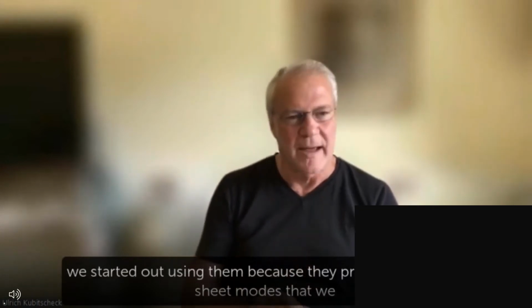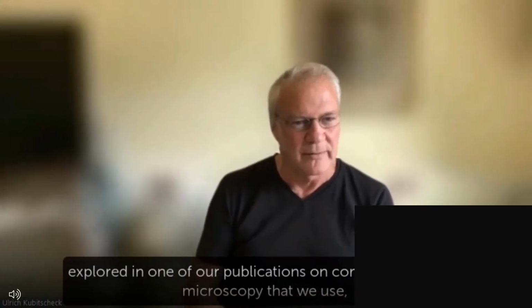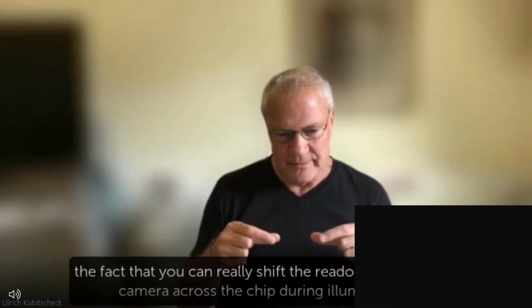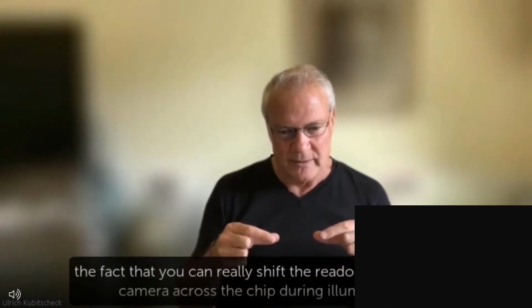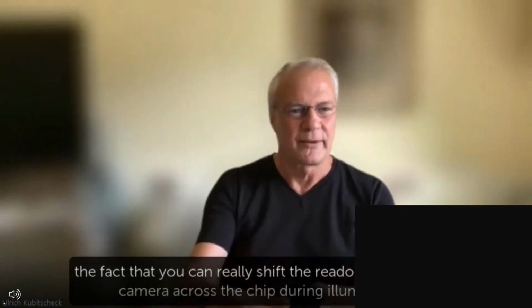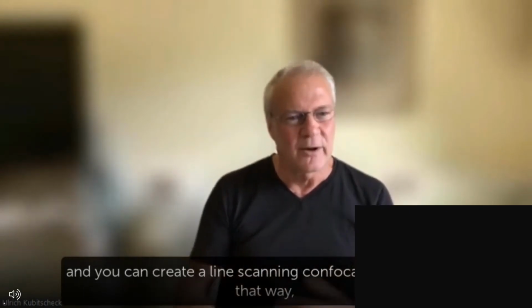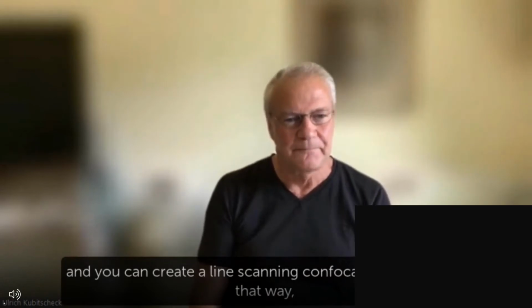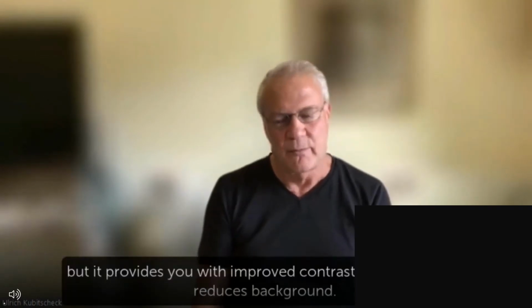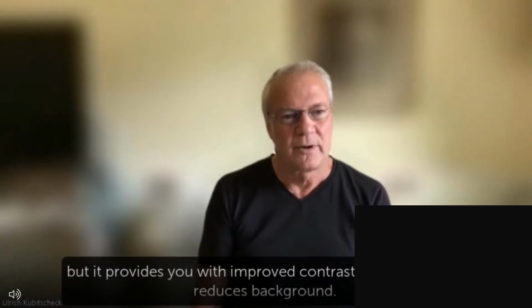We started out using them because they provide these light sheet modes that we explored in one of our publications on confocal light sheet microscopy, where we use the fact that you can shift the readout region of the camera across the chip during illumination, and you can create a line scanning confocal microscope in a very simple and straightforward manner, which provides you with improved contrast for imaging and reduces background.